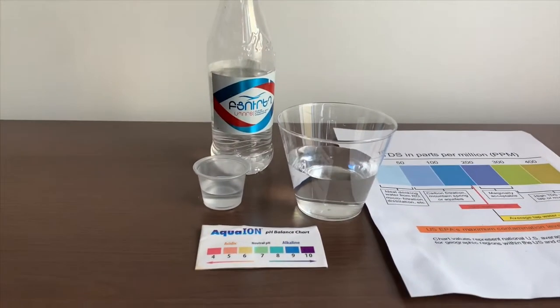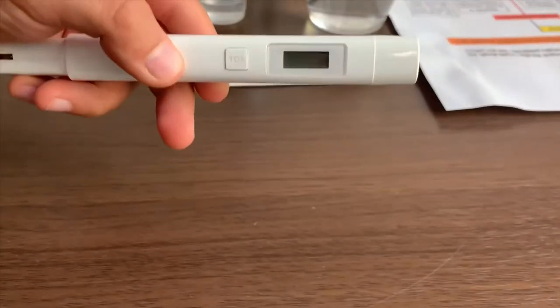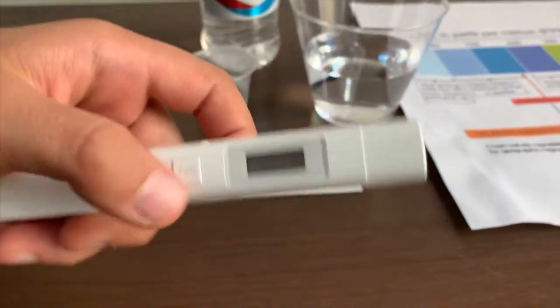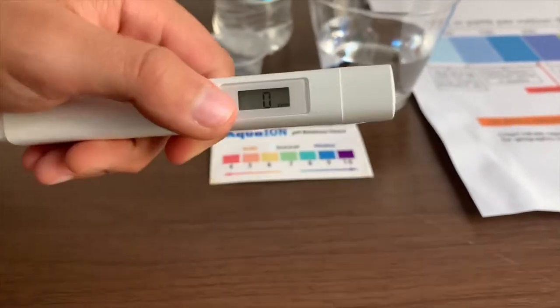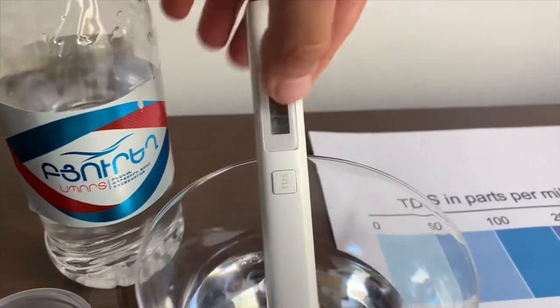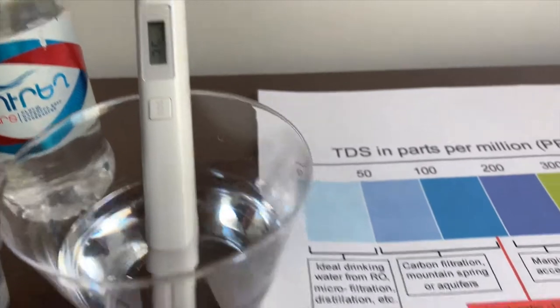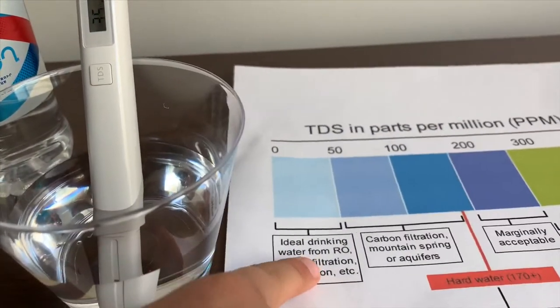First we're going to test the TDS levels. If you want to buy this TDS tester, check the link down below. Turn on the TDS tester, make sure it says zero, and put it in — 35. That is ideal drinking water.